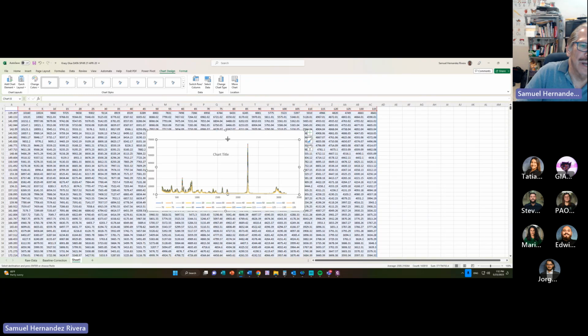And let's do that right now. I'm maximizing the Y axis. It takes time because there is a lot of data.